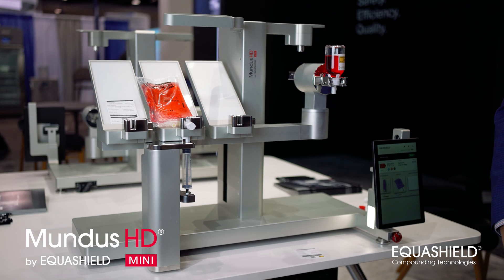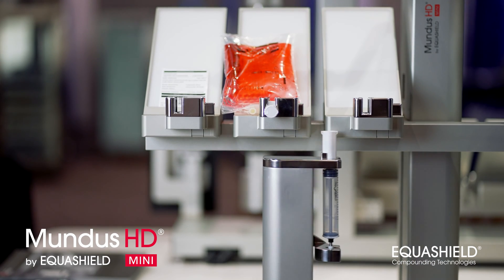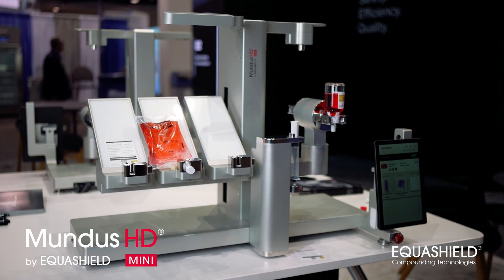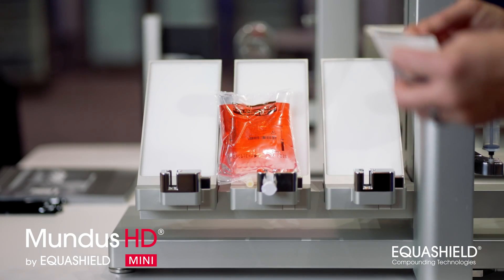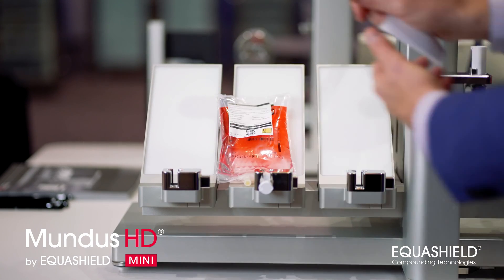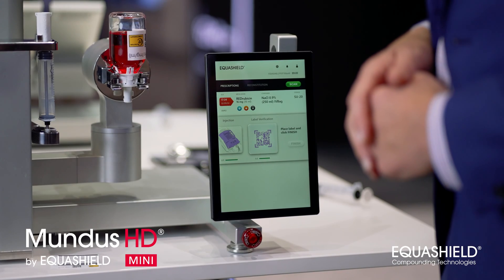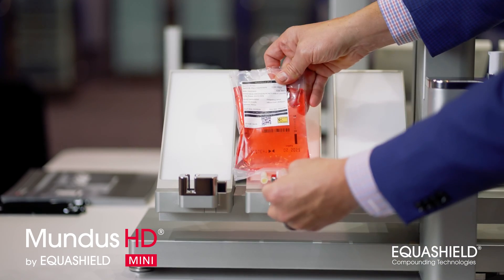It's taking a picture again of the bag. Then it will have me apply the label and then take one more picture to verify that I'm putting the right label on the right bag. So now I will reach across here, grab the label, place that on there, and click finish to take one final verification. You'll see it flash, and now it's ready to take out and you have your final dose.